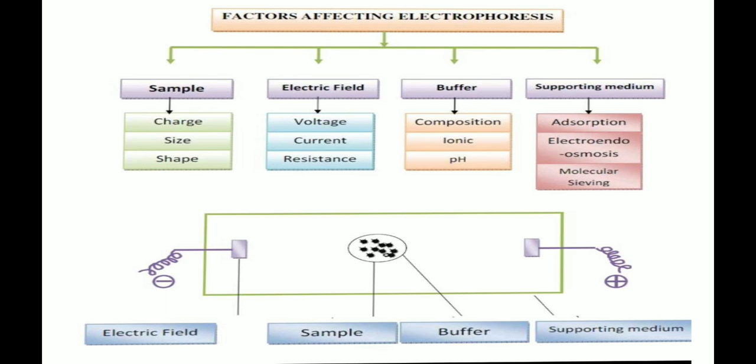There are some factors that affect electrophoresis. Like your sample: samples containing different charges, sizes and shapes, the separation will be based on those. So that can be a factor of that process, or it can affect your electrophoresis.